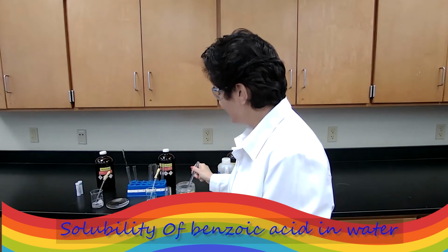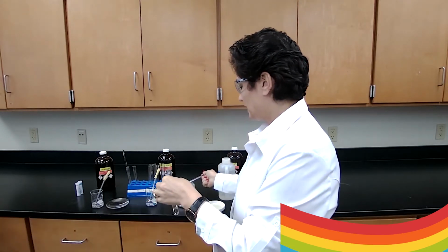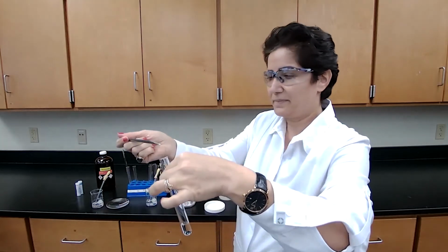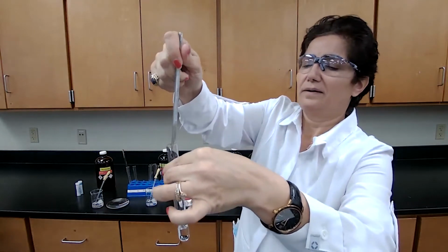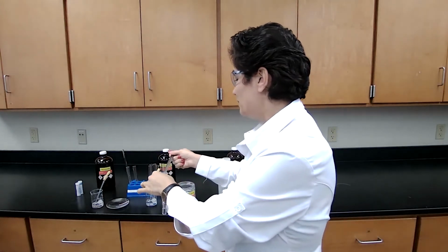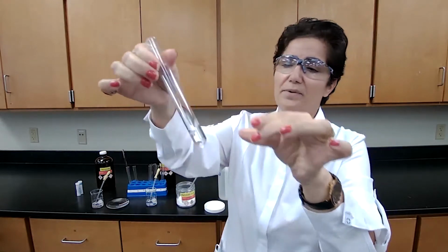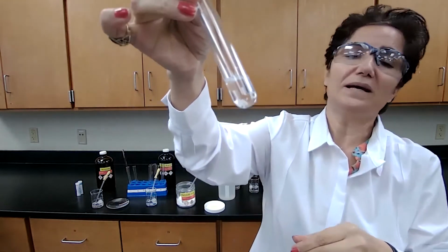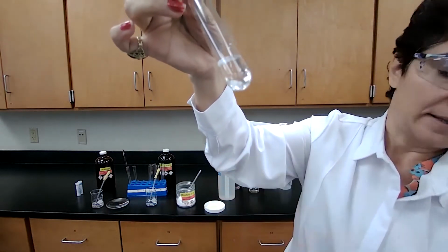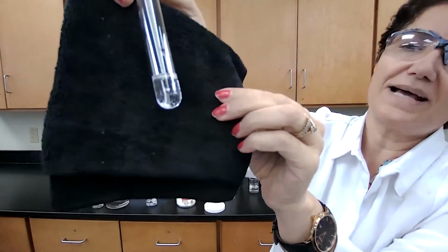Benzoic acid, I add the benzoic acid to water. I have the water and the benzoic acid. I'm going to have to add a little bit. Normally just add 1 tip of a spatula, but because of the camera, I just want to make sure that you could see the particles that are settled at the bottom of the test tube.